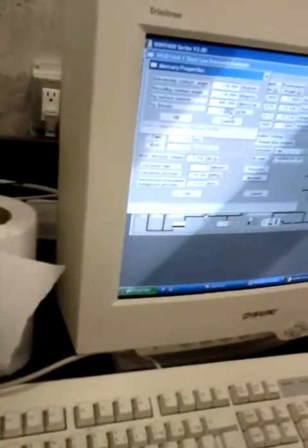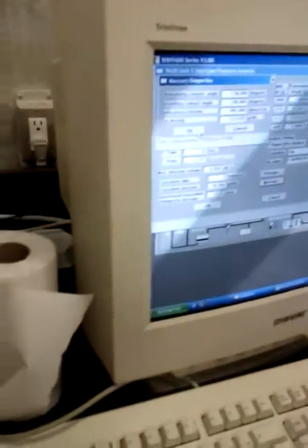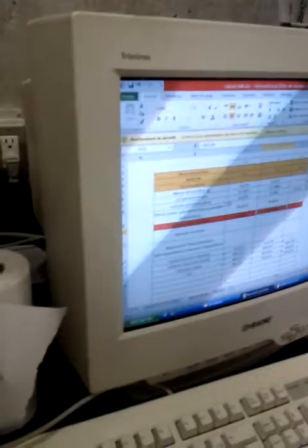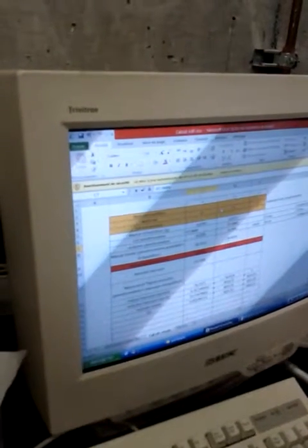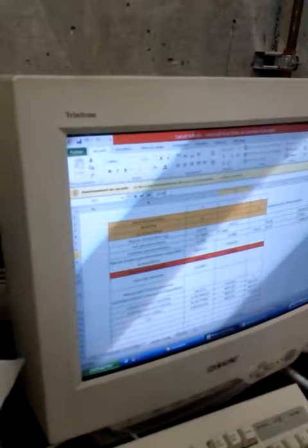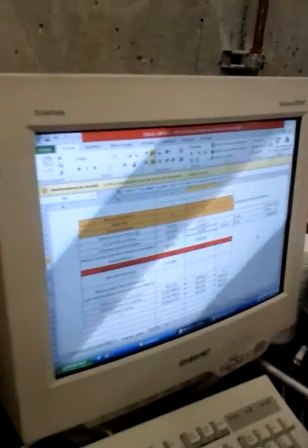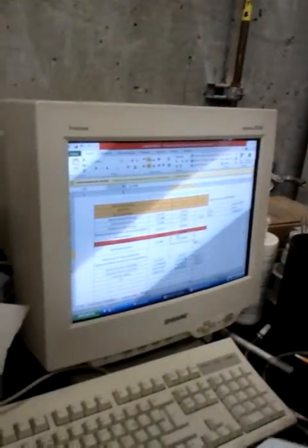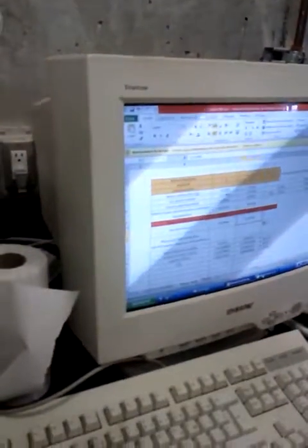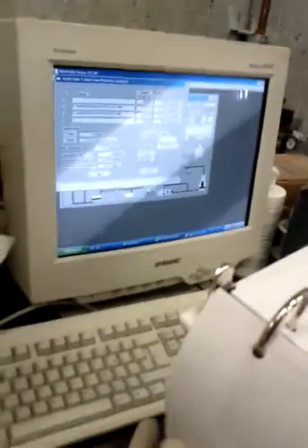So we go in this table, and we choose with the temperature. So it's 23, and it's over 13, but it's the value 4389. Okay. Usually I wrote it here, but here it's not. There's just a mistake there because I put it as an example. Okay. Here is the same, the same temperature. So when we have done all this, we are okay to begin the test.